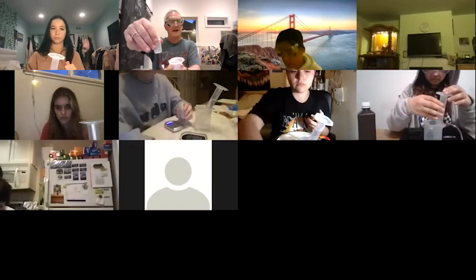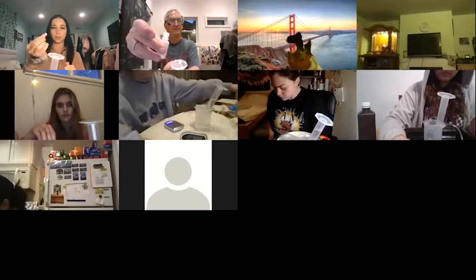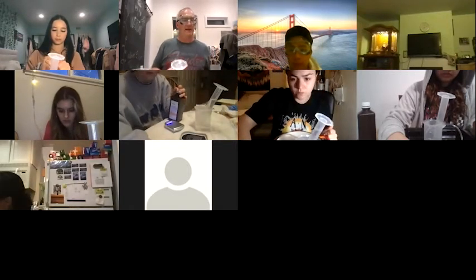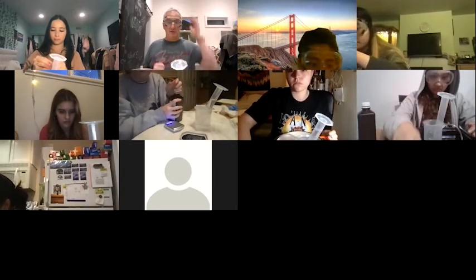As soon as we add the hydrogen peroxide, we're going to snap this end up onto the top of this 15 mil tube. Oh, I don't have to put this on it? Oh, yes. Okay, so that goes on the other end. Make sure you push it on good and tight, because we don't want that coming loose.